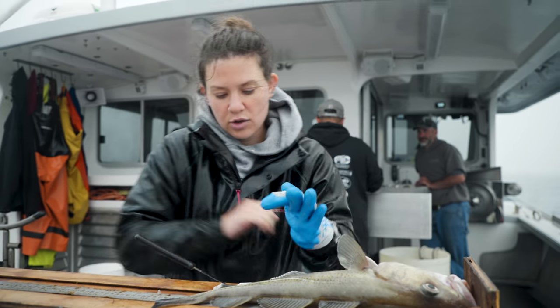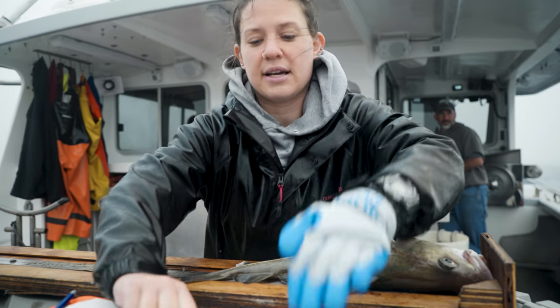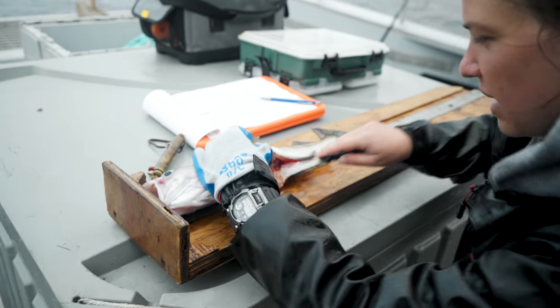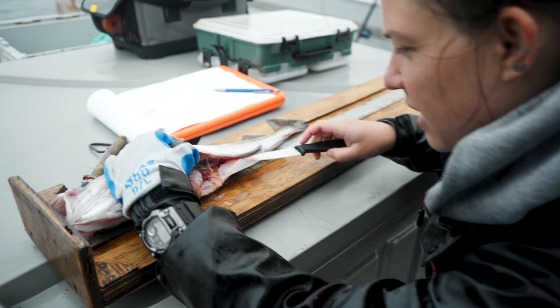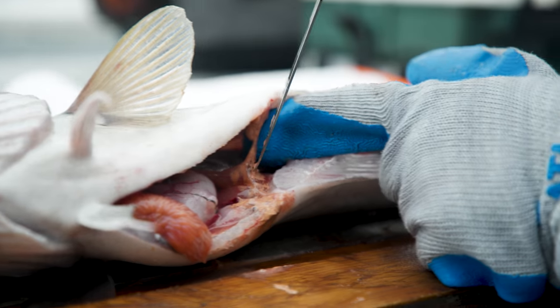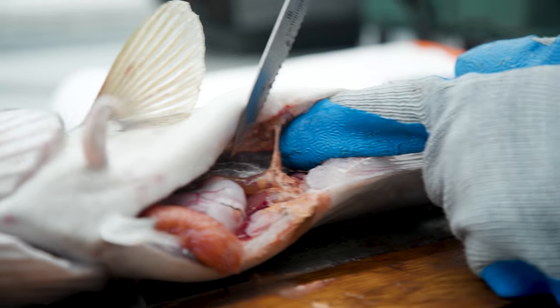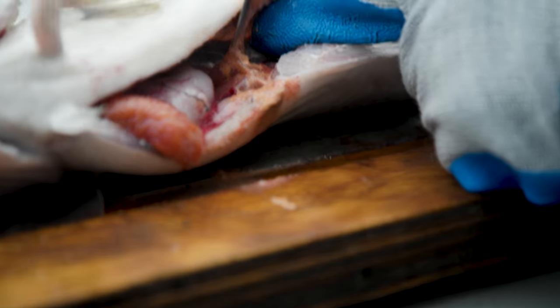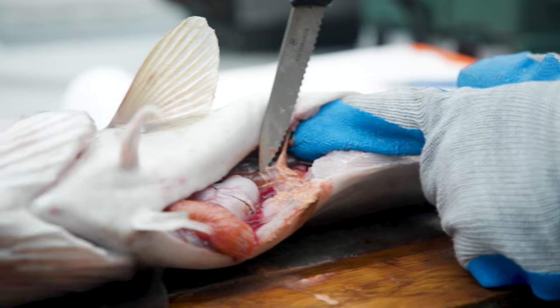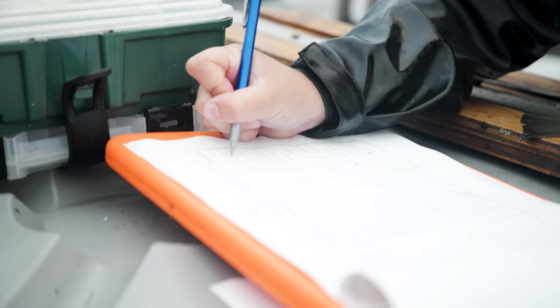The next thing that we need to do is figure out the sex and maturity of this fish. This one is a female — you can tell right here, these two things are her ovaries. But she's a juvenile so she isn't actually developing eggs yet; they're very small and very pink, so she's a juvenile.